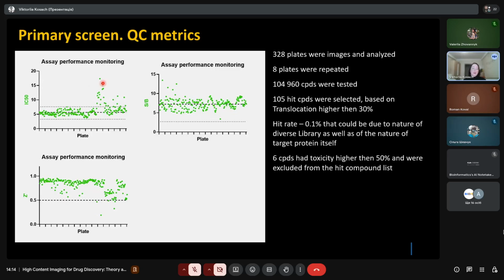So this is one hypothesis. And the second hypothesis is that at nearly the same time, the robotic arm that transferred the plates to the microscope had broken.